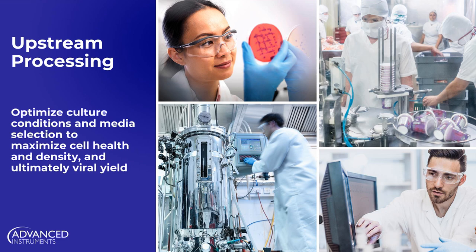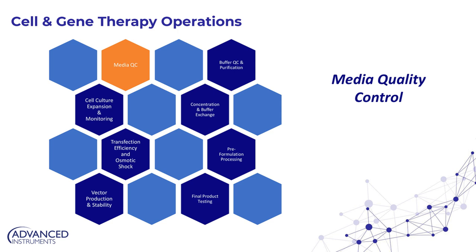So let's start with upstream processing. First of all, I wanted to take a quick look at something that maybe some of you are already using for osmolality testing, or an area in which you're already operating some of our equipment, and that is media quality control.